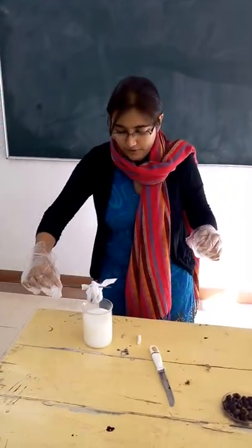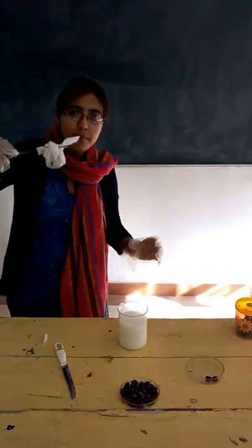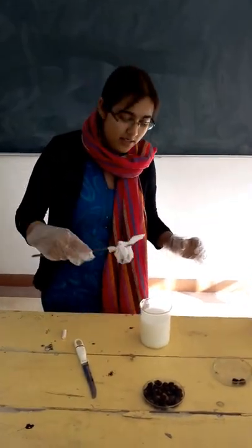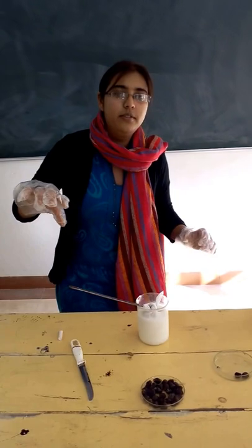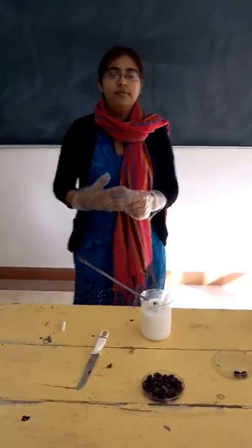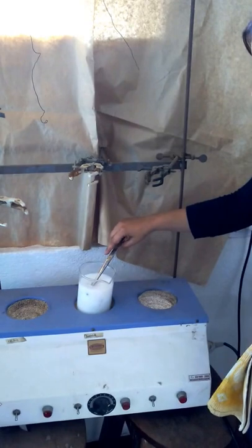We will make a bag of the seeds. We will now take some cow milk, or we can also use coconut water or cow urine, and we will dip this bag containing the Semicarpus anacardium seed nuts into the cow milk.